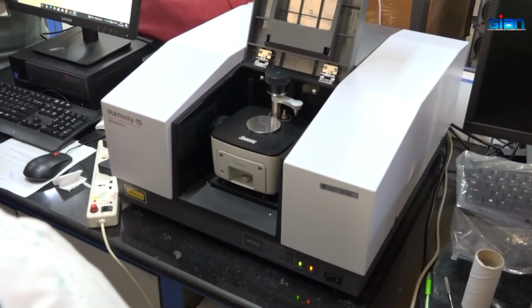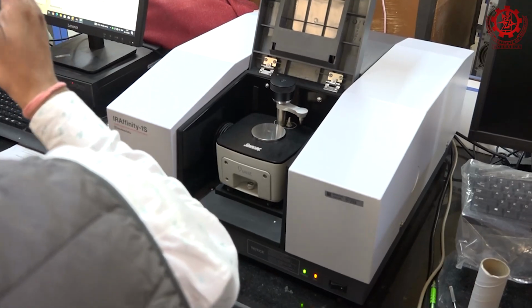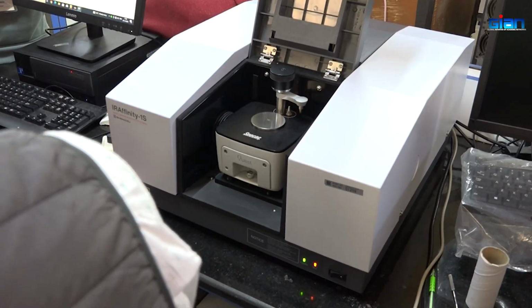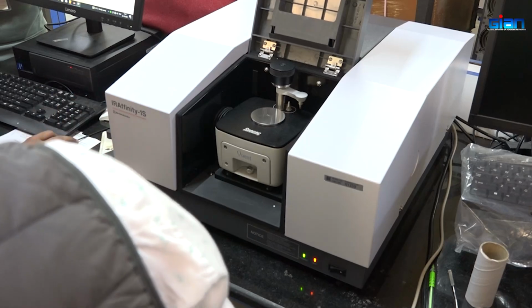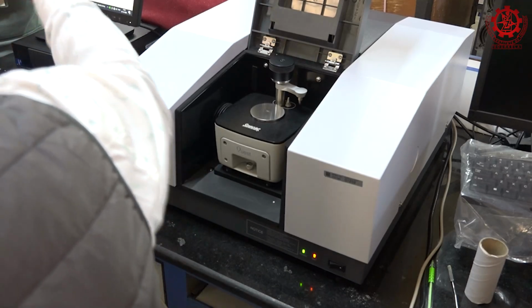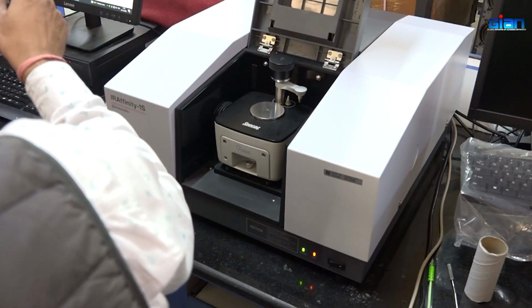So what we did is first we take the blank scan. Blank means we don't have our compound. So anything else, any gas in the air, or if some impurity is also there, anything, that will give a peak there. But we are not interested in that peak, remember.